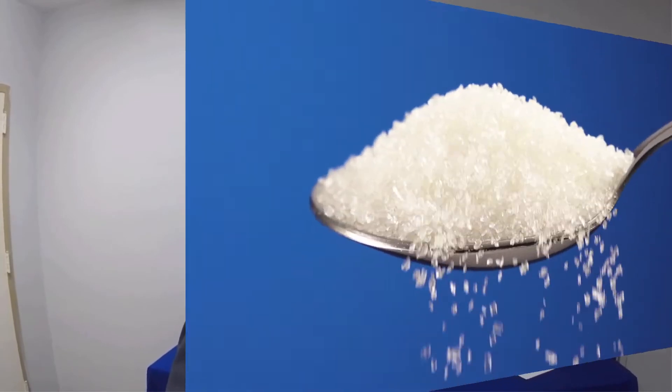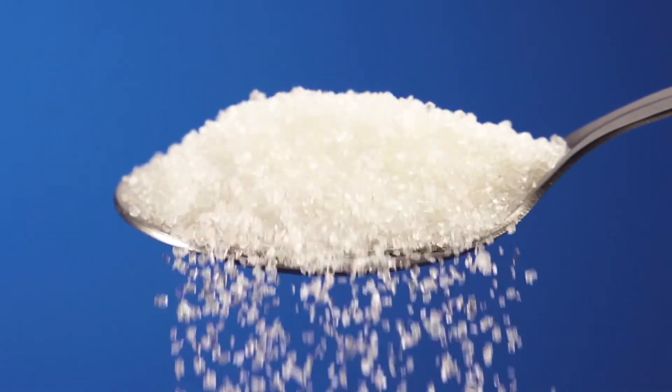You may also concentrate apple juice up to a solid in the can, and then use the refractometer to ensure it stays consistent so that when you add three or four cans of water to it, it tastes like it should. In other cases they sometimes add sugar to the juices, so they want to control the Brix content — and that's where the refractometer excels.